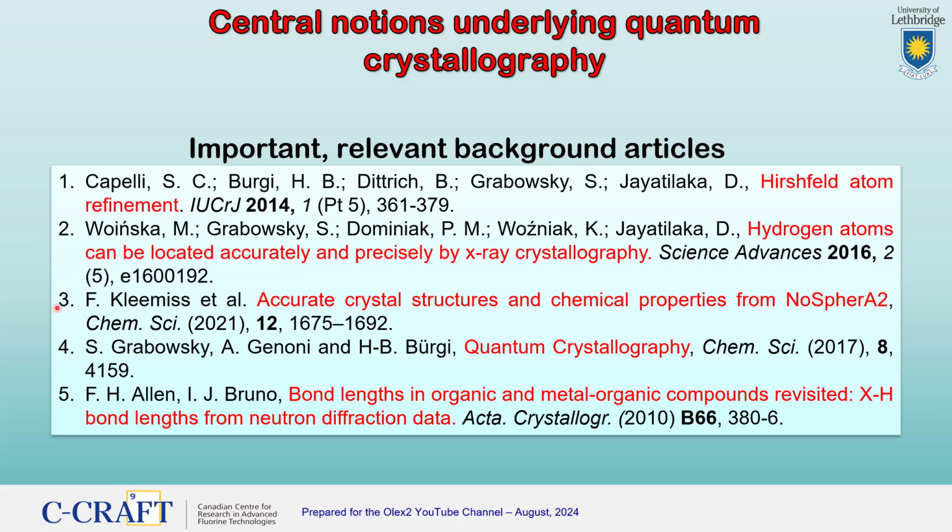One of them is the one I've already mentioned, this key introduction article by Florian and his many co-authors that really set the stage for this method. But these other articles are also very important to set the context of what's going on here in the modern thinking and application of quantum crystallography as it is applied to chemical crystallography, or even routine chemical crystallography.